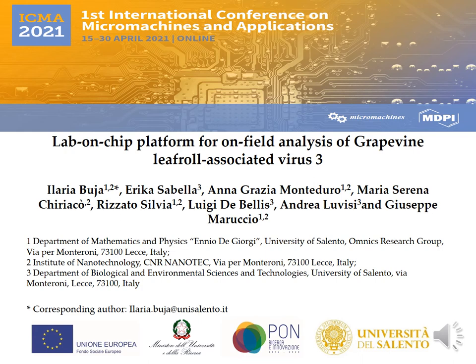Today I want to speak about a lab-on-chip platform for in-field analysis of Grapevine leafroll-associated virus 3. The theme of research is in synergy with the National Strategy of Smart Specializations approved by the European Commission in the areas of smart and sustainable industry, energy, environment, health, nutrition, and quality of life. The project proposal is realized in cooperation with Professor Andrea Luvisi of the Department of Biological and Environmental Sciences and Technologies and Omnics Group of Professor Giuseppe Maruccio at the University of Salento.